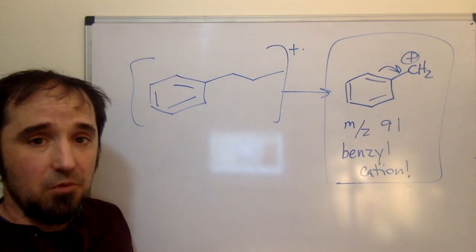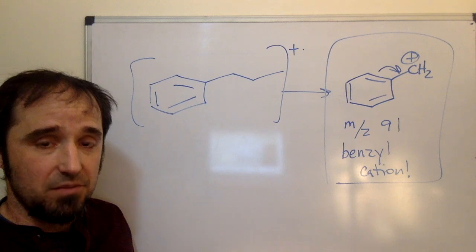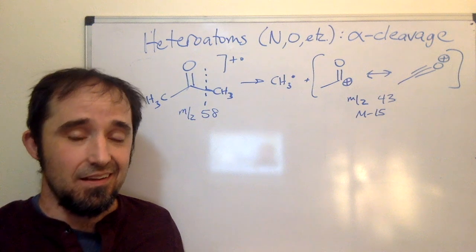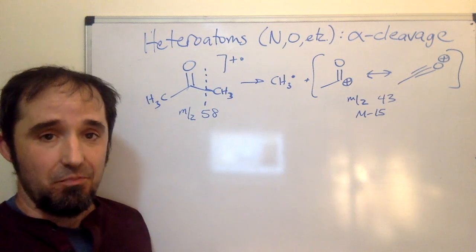So that's going to be the most important fragment we see from this mass spectrum. Okay, so you can teach a whole class in fragmentation of mass spectra.